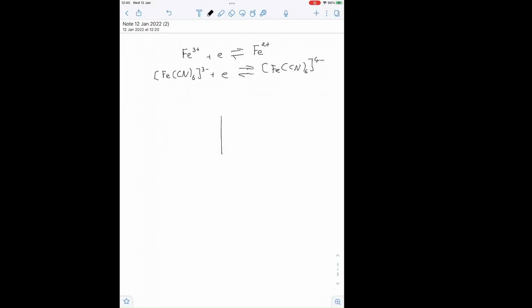Okay, and let's start off by just taking a beaker of electrolyte containing some Fe3+ and some Fe2+ and some nitrate ions to essentially say we haven't got any charge. And we need a source of electrons. So let's make this a platinum electrode. Electrochemistry is always expensive because they always use platinum, and they use platinum because it's an inert metal.